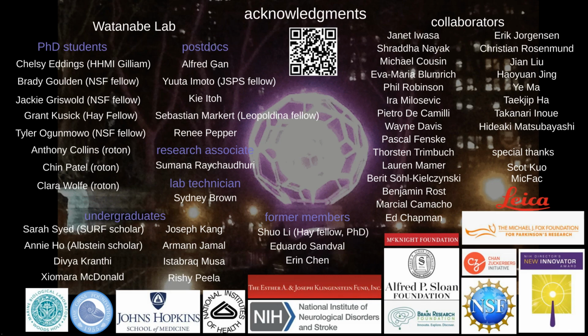Where flash can be really important is that it gives you all the advantages that you get with channelrhodopsin in neuroscience generally. That is, if you're working in an intact organism or in slices and you want to stimulate specific pathways or specific neurons, then you're obviously going to use flash. So it's going to be good for a lot of systems like that. Apart from the things I discussed, the differences are mostly subtle. It's just what's best for your system in terms of what you're trying to investigate.